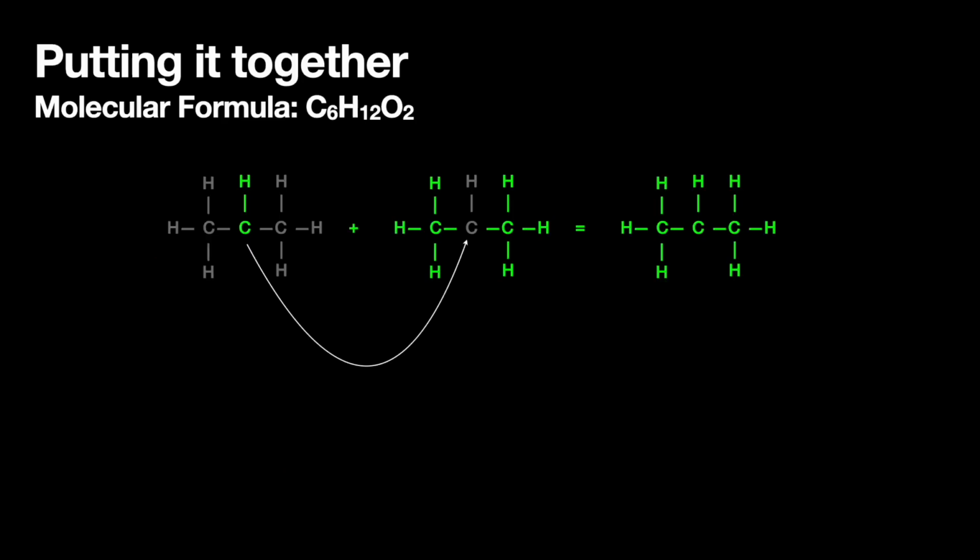We piece together the obvious molecules first. Written in green are the atoms determined by the hydrogen-1 NMR, and in gray are the reported neighboring configurations. This is the easiest piece that we have because of the exact match in shape and the unusual number of hydrogens attached to the neighboring atoms.